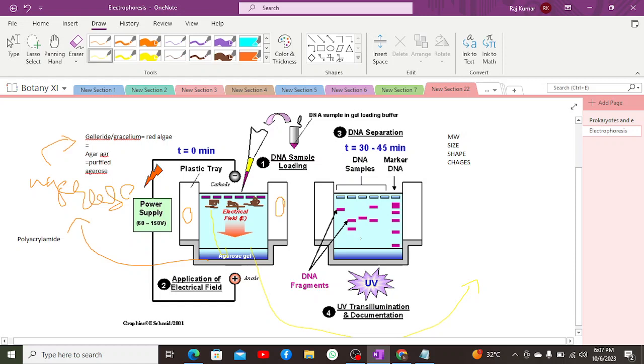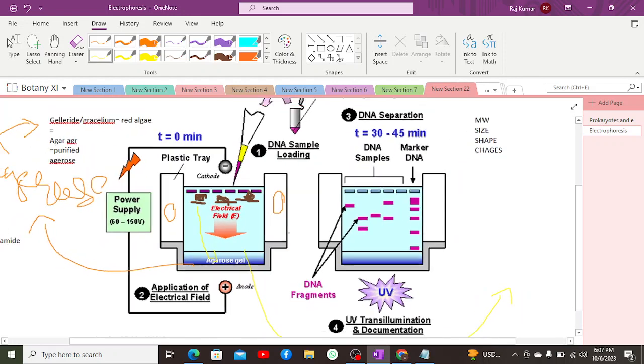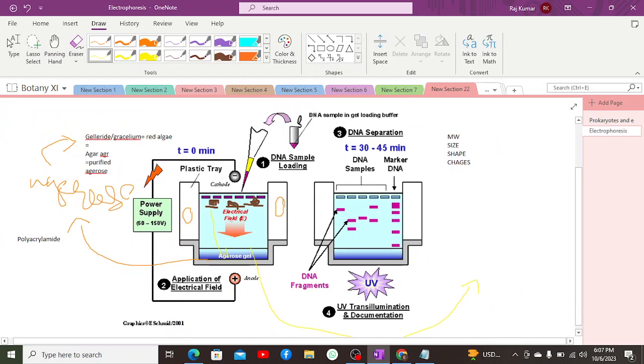Why do molecules with less size move faster? Less size molecules have less molecular weight, due to which they move faster. And secondly, as I previously taught, the sieve pores are quite small, so smaller molecules can pass through them fast. So molecules with less molecular weight move faster, and vice versa. Large molecular weight macromolecules will move slower. So this is how it works.